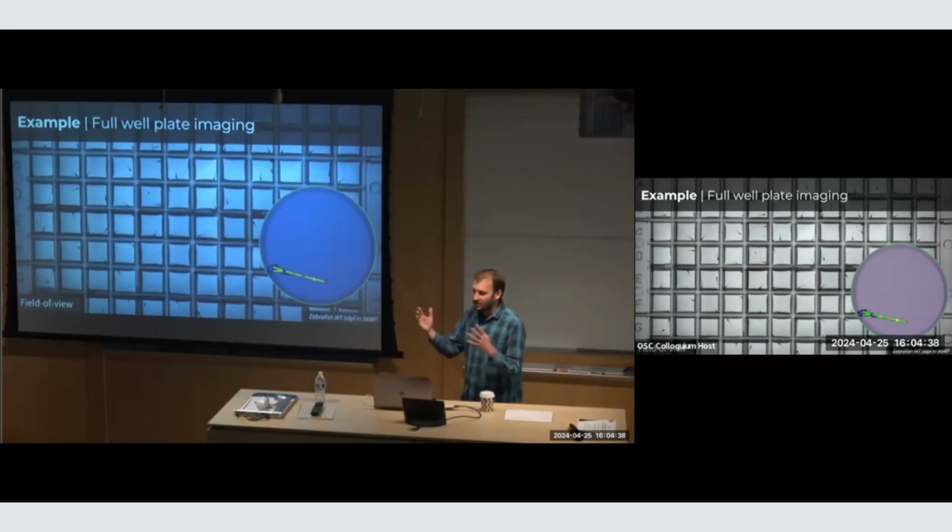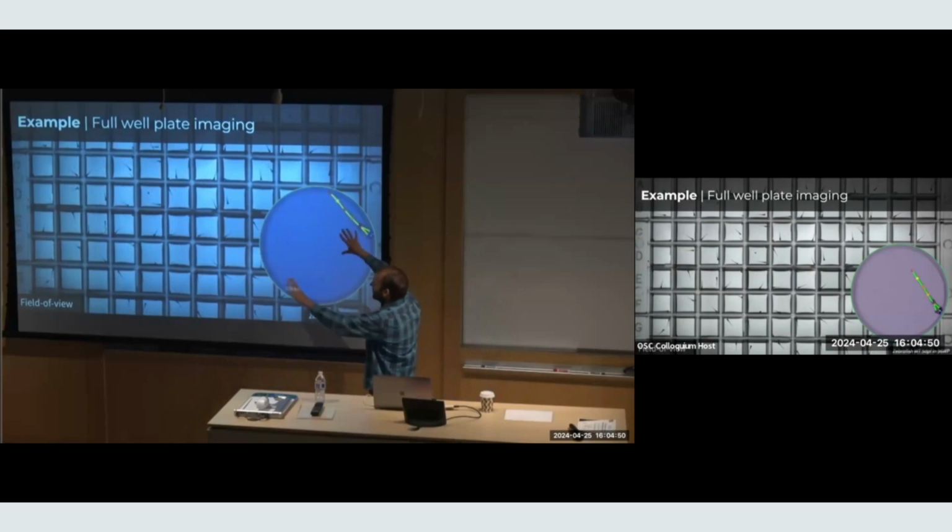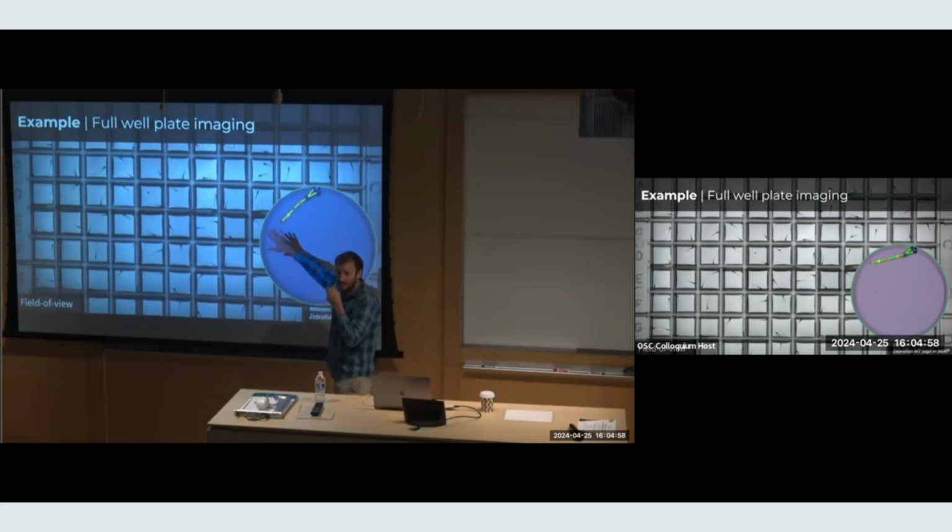Okay, so this is just an example, a really short video. It's hard to show these very large images, right? Naturally on a megapixel projector, there's like a gigapixel of resolved spots. But essentially, we can see anywhere in this field of view. This is a well plate. So a big application of this is to look at organisms or other specimens in what are called well plates. These are plates that biologists routinely use and put different specimens in to study them. And we can capture anywhere in this space at this type of resolution.